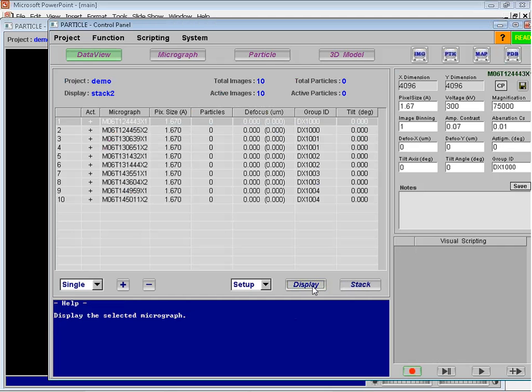Please be a little bit patient with this notebook computer. On a workstation, it should take just a split of a second, but this is a really old notebook. I hope it runs.